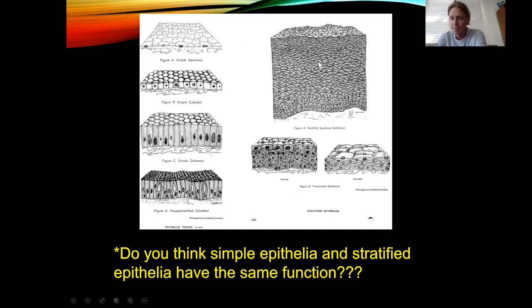Here we have a stratified example. Here's my connective tissue. Here's my basement membrane. And then we have multiple layers of cells in the epithelium, all stacked on top of each other. That's true stratification. But we also need to identify the shape of it. And there is a rule of thumb that we follow when it comes to identifying the shape of the cells when it's stratified. It is going to the apical surface or the surface towards the open space. So that would not be down here. This is more basal. All right, this is actually the basal layer right here. You can see if we went to the basal layer, we consider cuboidal, but this is actually stratified squamous. If you go to the apical layer way up here, that's where you're going to see that squamous cell. And so that's the rule of thumb that we follow. So that'd be stratified squamous epithelium.